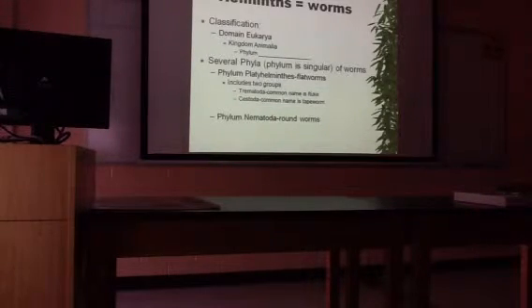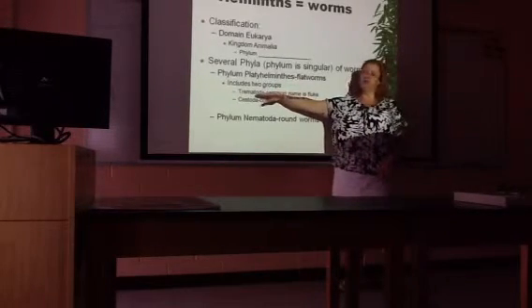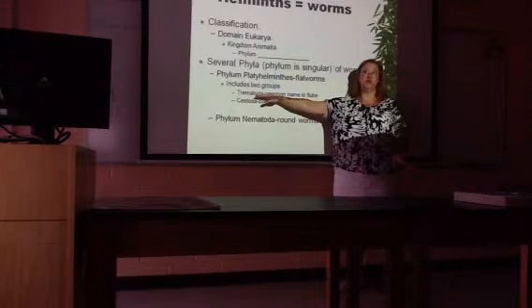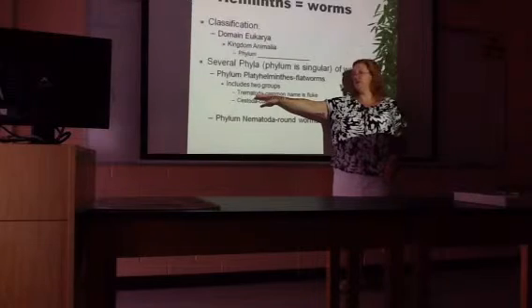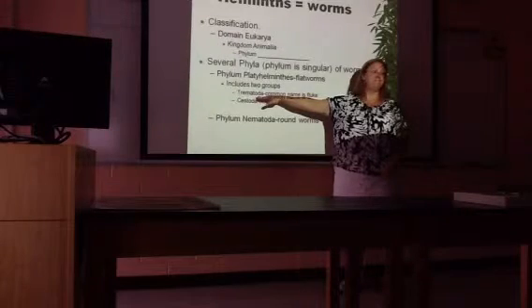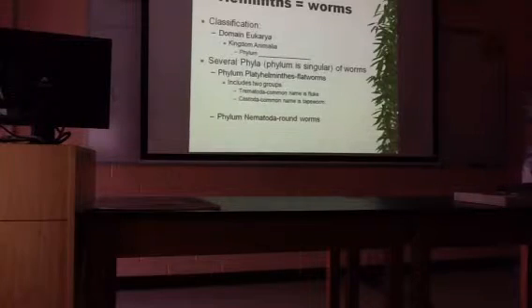The first 5 slides, all of the schistosomas through Clonorchus. Page 41 we're looking at here. The first 5 slides listed under organism. Those are all phylum Platyhelminthes, group Trematoda. So if you were to see a picture of one, that's what I want you to say. Not schistosoma or Clonorchus, but phylum Platyhelminthes, group Trematoda.